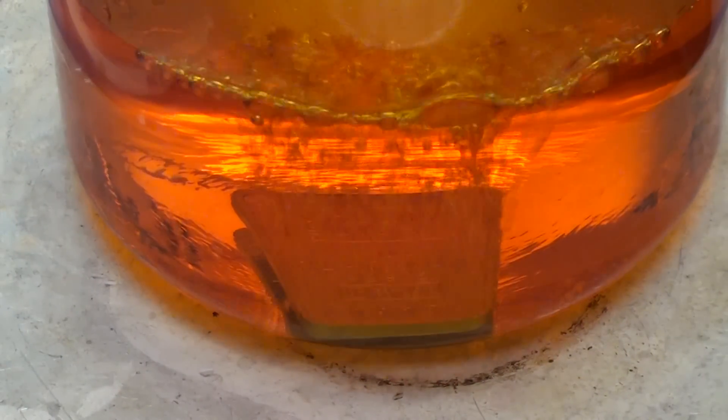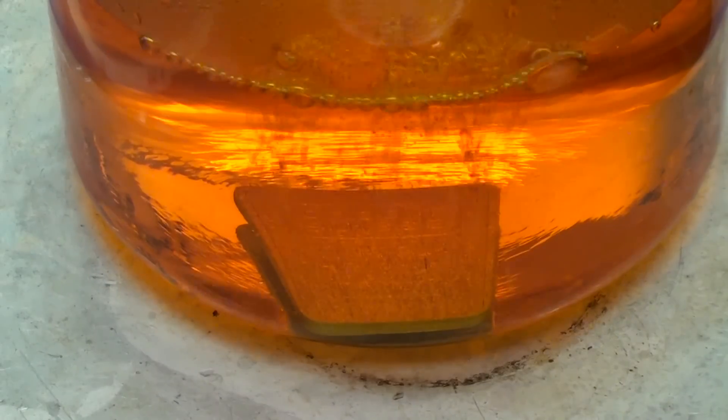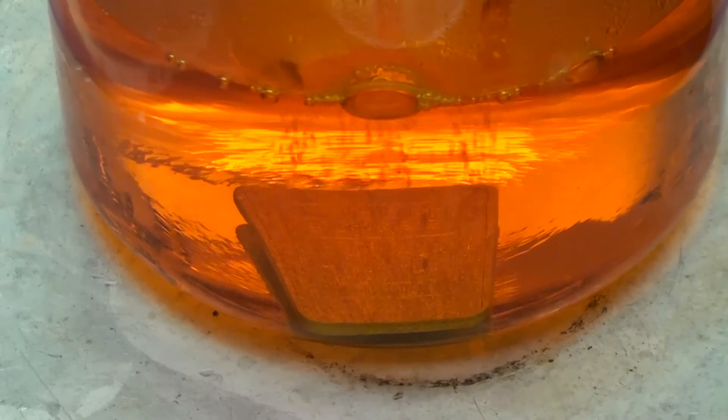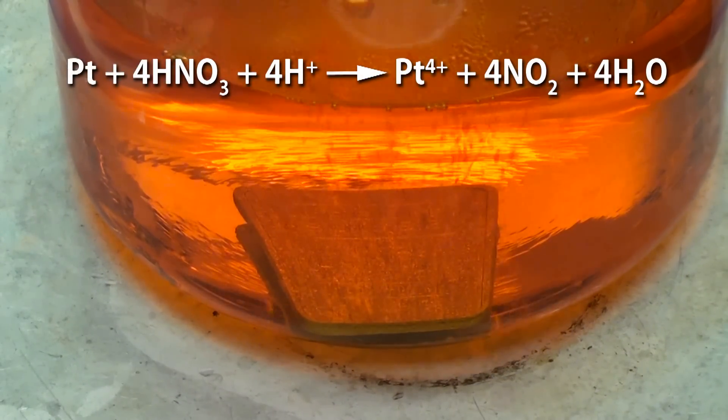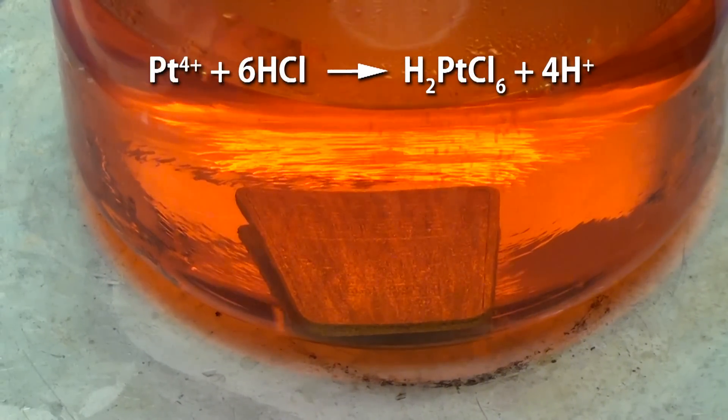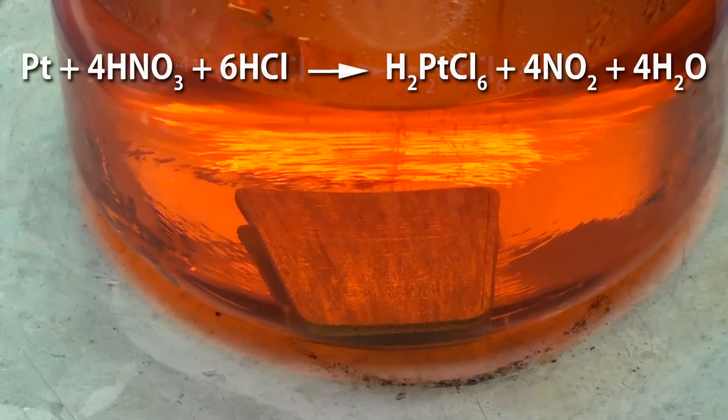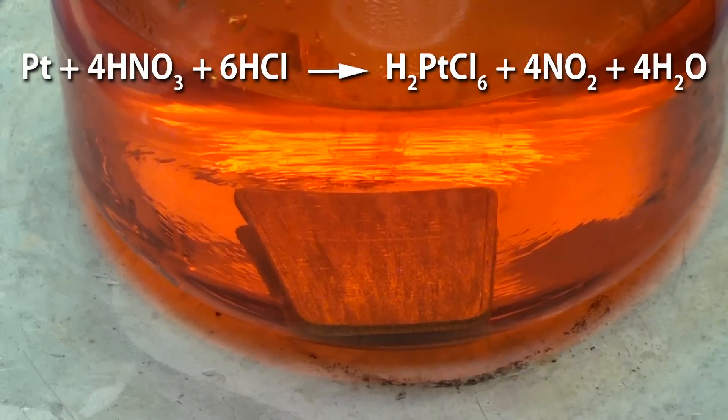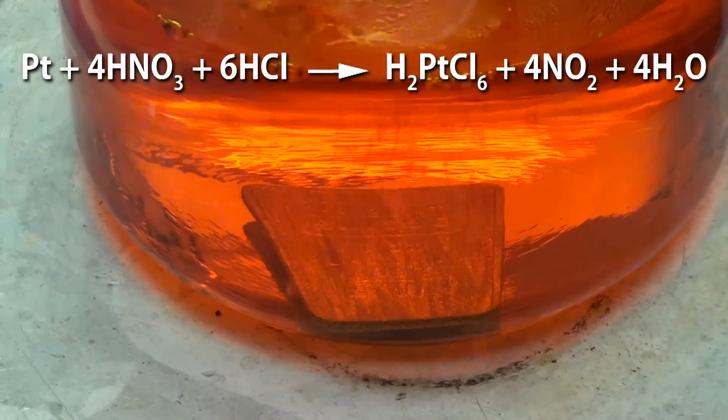The solution is heated since the dissolution of platinum is extremely slow at room temperature. What's happening is the platinum is reacting with nitric acid to produce platinum ions that are then complexed with chloride ions and dissolve away. The overall reaction produces hexachloroplatinic acid, also known as chloroplatinic acid.